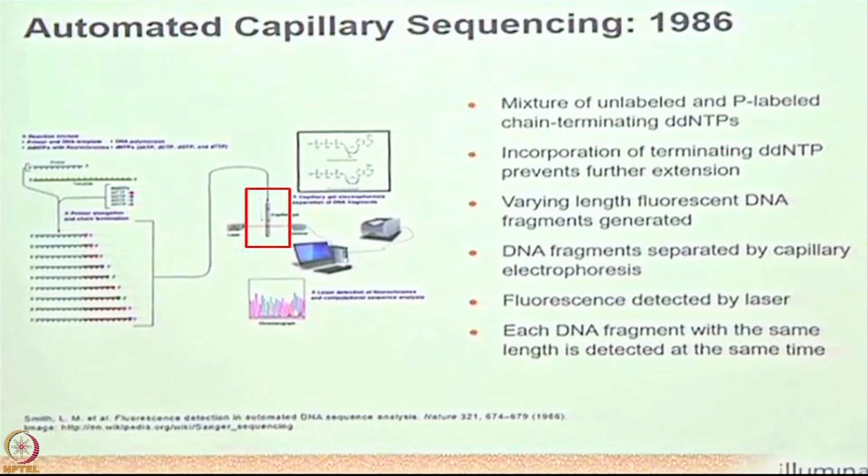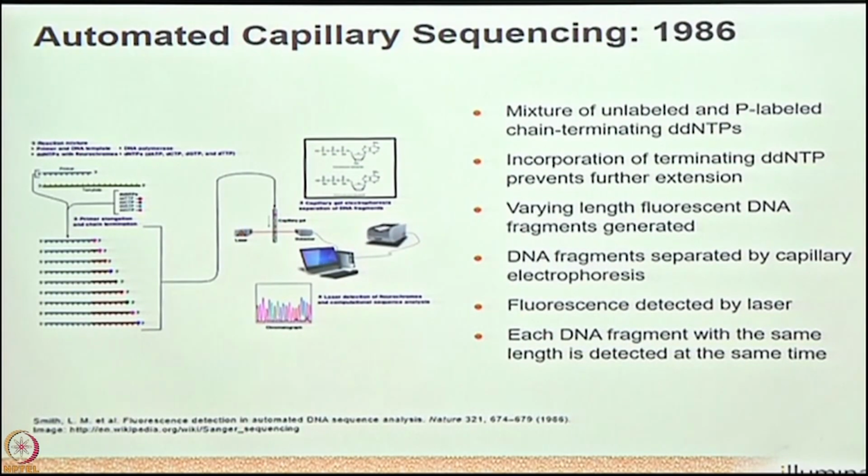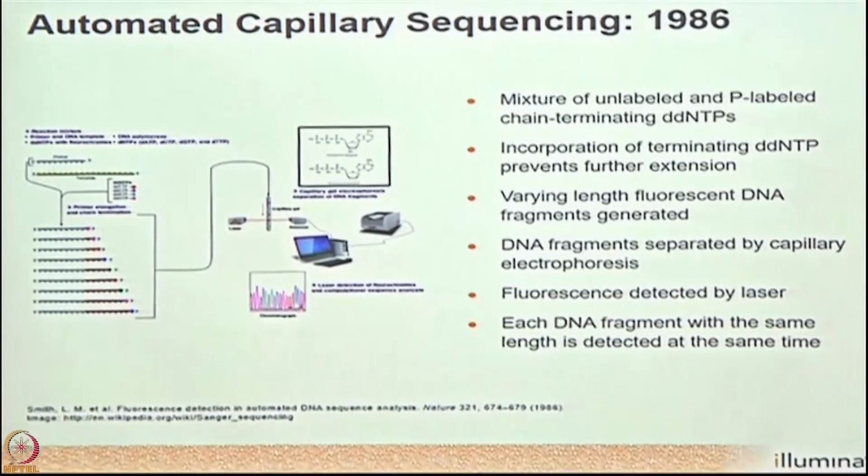So, what we do is, after this sequencing is done, we flow all these sequences through a capillary, and you can see there is a detector. All the sequences are labeled with a fluorophore on the last base. So, the smallest one, the upper one, will be flowing through the gel first. Okay. So, through the gel, that topmost sequence will pass away first. Okay. So, let's say it contains A. So, you will get a signal for A.